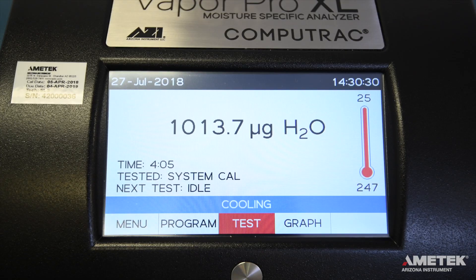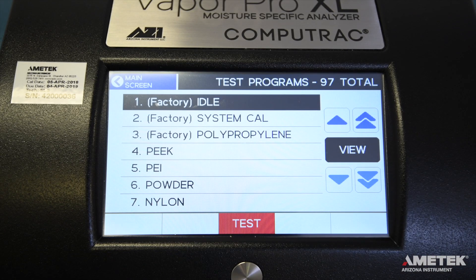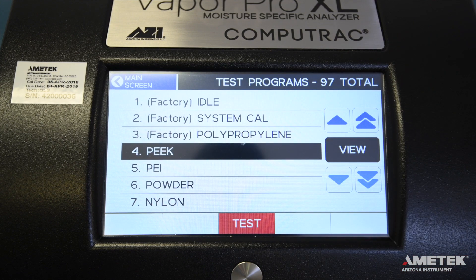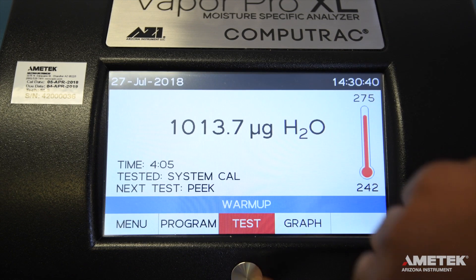In order to perform a test on your CompuTrack Vapor Pro XL, you must first select the correct test program. Touch the program button on the bottom left of the screen to view the list of available programs. Use the arrow keys to scroll through the list of programs until you find the one you wish to use. Touch the program name to select it, then touch the silver home button.